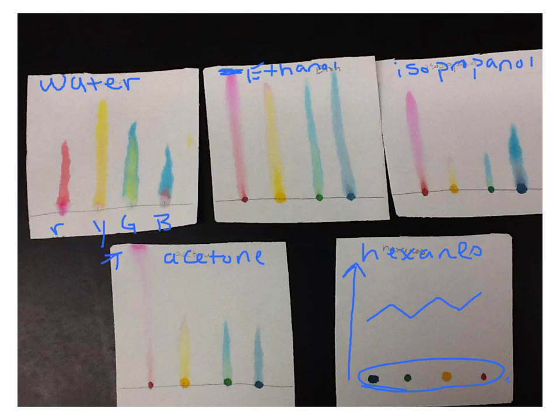So hexanes would not have been a good choice for you guys, okay? As you can see, with acetone, the red dye tended to like the acetone. In comparison to water, if you look at this, you see how far this peak traveled up here? And then over here on water, it was one of the lower ones. So you would say that the red 40, the red, liked this solvent a little bit better. Okay, so it tended to like a solvent that was a little bit more nonpolar.